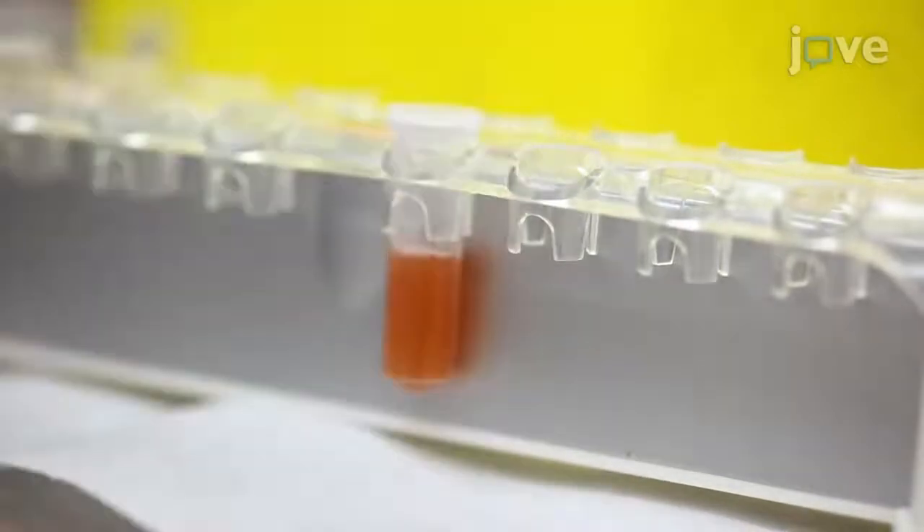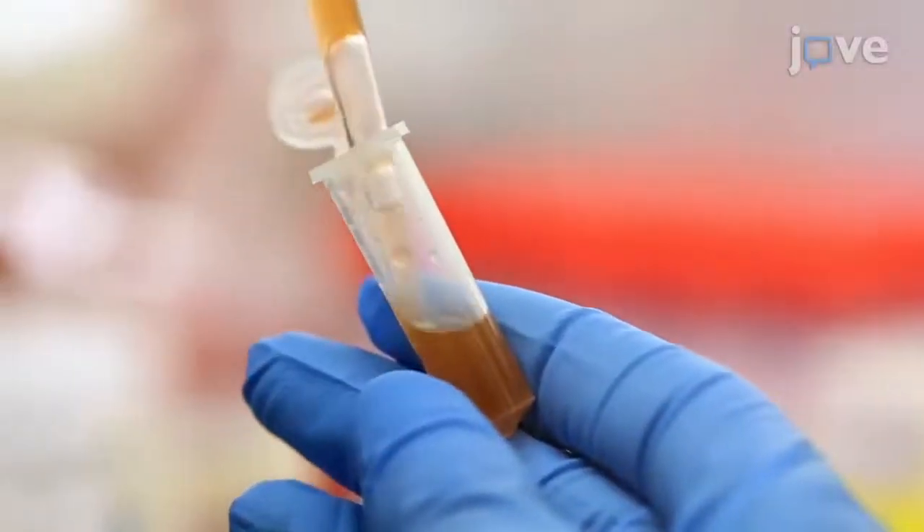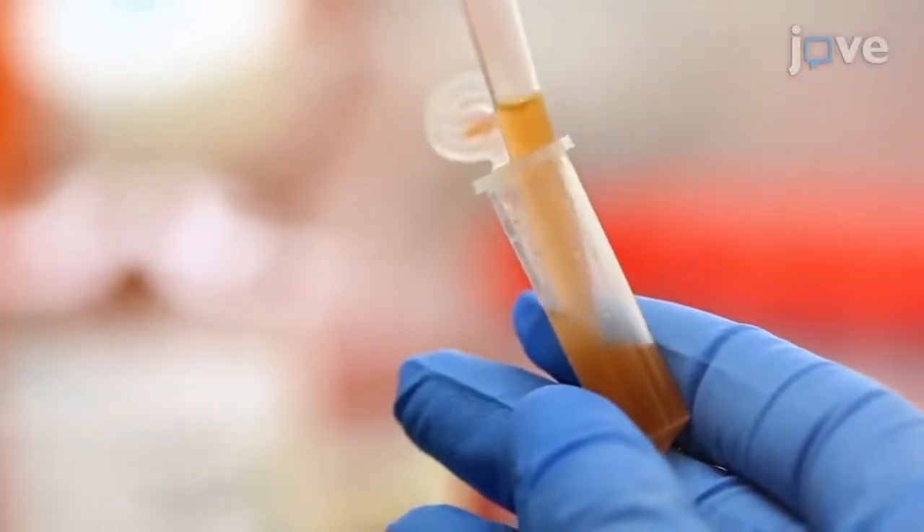Individuals new to this technique will likely struggle with the optimization of target-to-effector cell ratio. My advice is to do a thorough search of the literature to determine the ratios that you will test when optimizing the protocol.